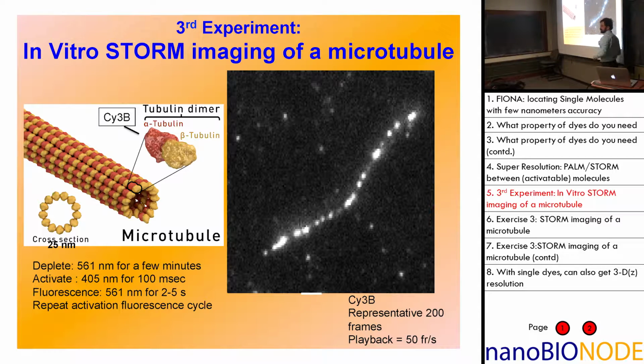This is kind of lousy in that you had a dye here and a dye here that's both on. So when are we going to say that we're going to turn our 400 nanometer light down? And when are we going to say, oh, okay, that looks good? Right? So, okay, why don't you get together and talk about this and give me the answer.